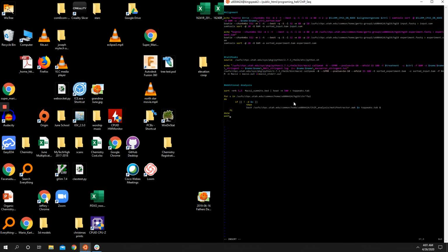And then if we add this little wait command, that means it'll wait until all of those background jobs have finished so that we can continue on. So that speeds things up. It's essentially like using the -p command up here to speed things up. We're multi-threading technically.